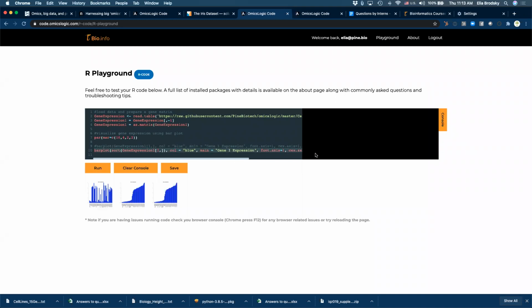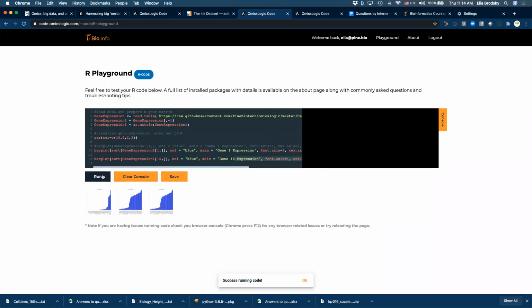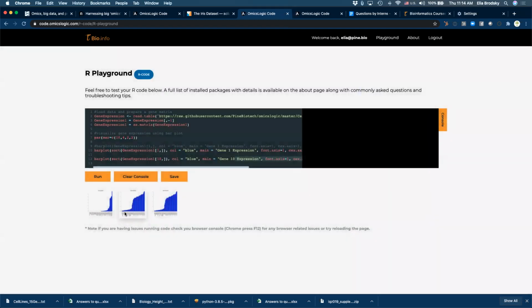So let's just compare the two. We're going to do it one time for gene 1 and one time for gene 10. So this is gene 1 expression, and this is gene 10 expression.